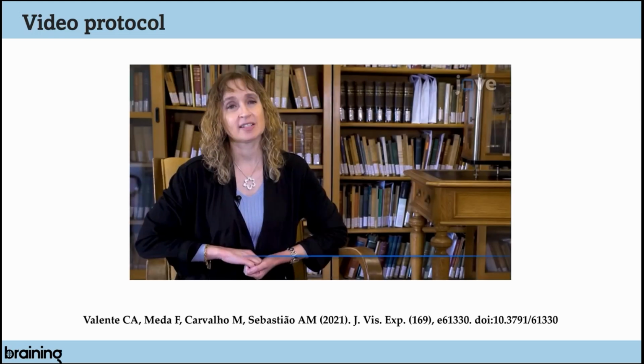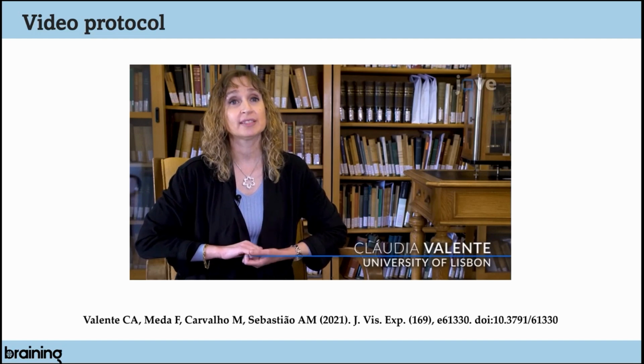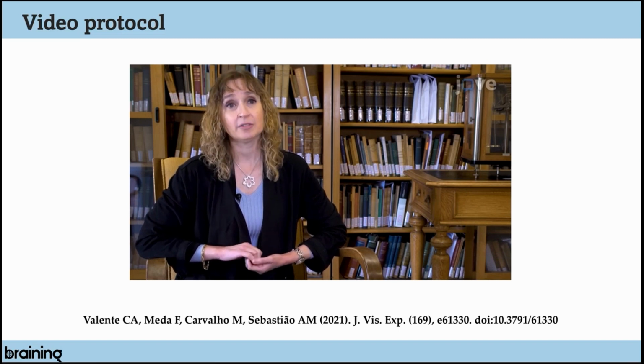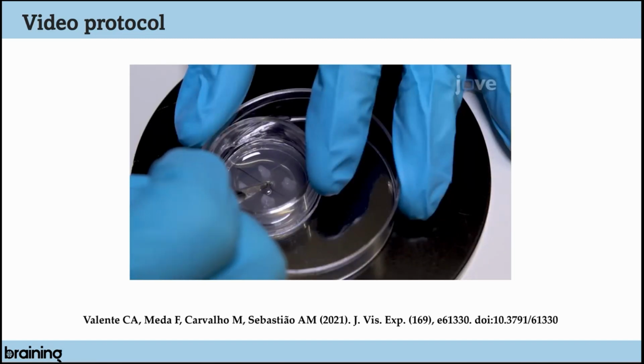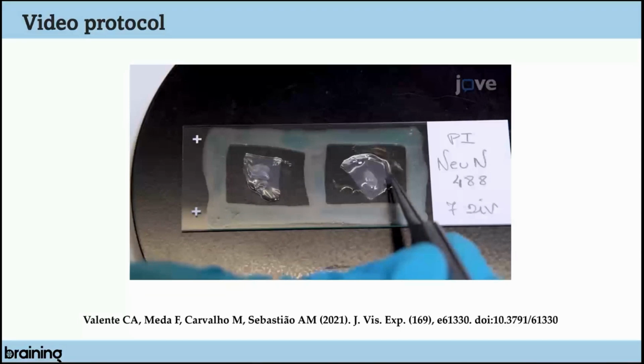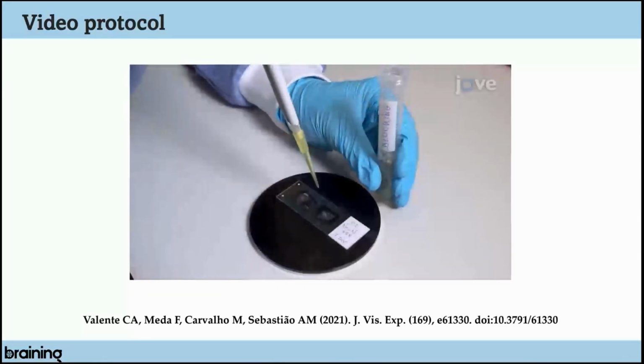Prepare rhinal cortex-hippocampus slices with extreme care. Make sure to remove the excess tissue above the hippocampus, as it can compromise slices' integrity during slicing. Structural deficits will negatively impact upon slice viability. In addition to the demonstrated approaches, a plethora of assays such as Western blot analysis, real-time PCR, and ELISA can be applied to this system to address specific questions regarding epileptogenesis.